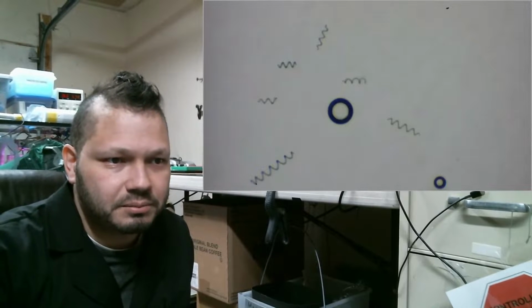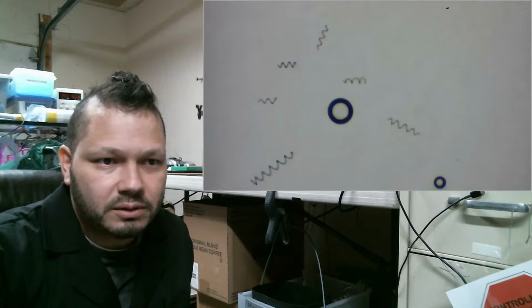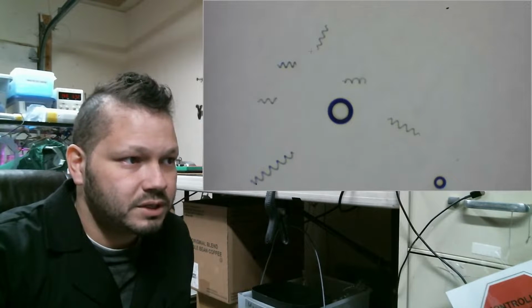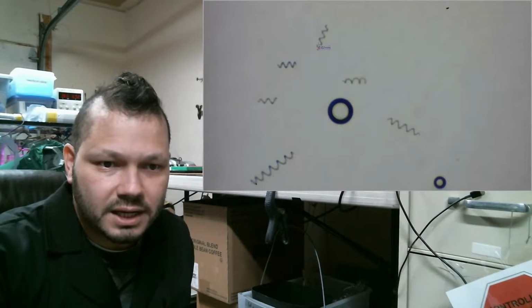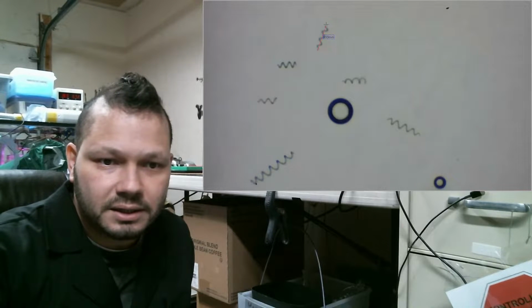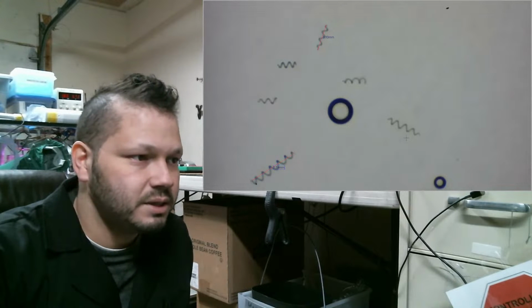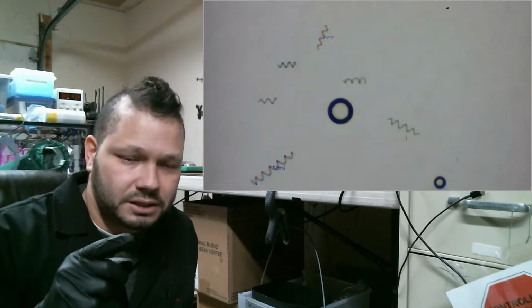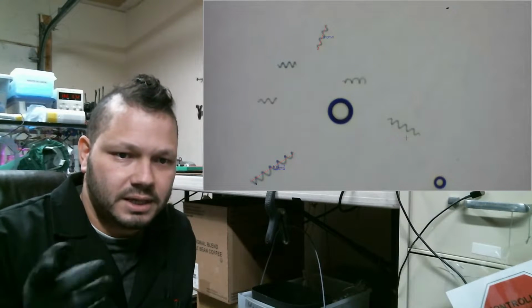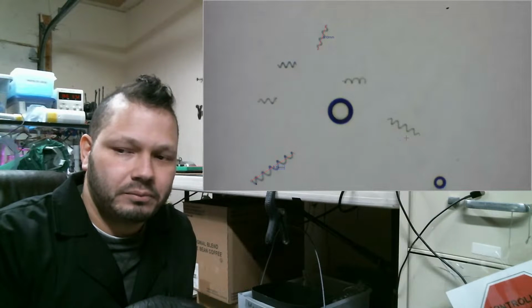So it can get pretty tedious, but I'm going to show you essentially how it works. There's this little tool where I can click on one side and then pull it, and this one's 0.1 millimeters. And what's really cool is if I do this on an entire picture, I can actually take those measurements and download them to a spreadsheet.